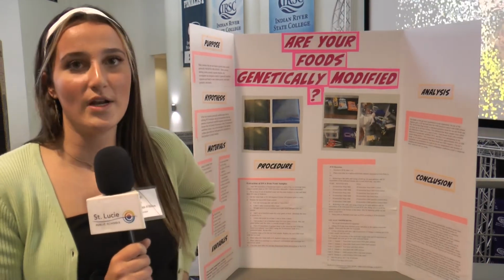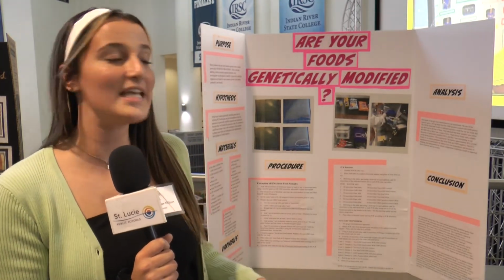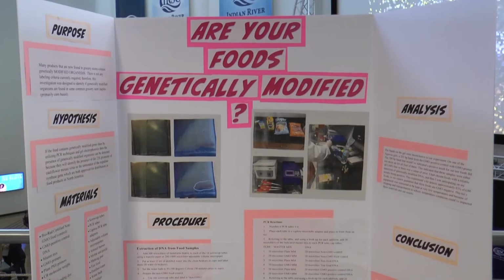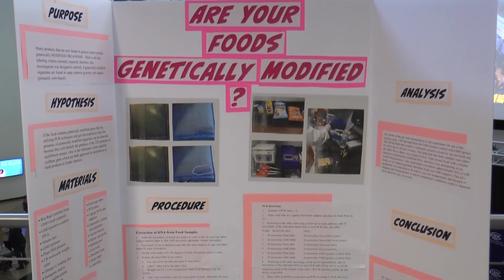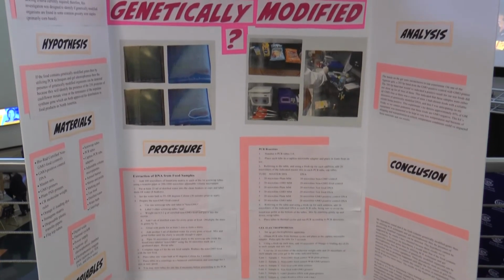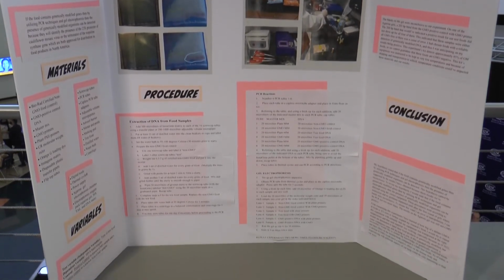And as of 2022, there's a new law that companies have to label their foods as bioengineered or not. So my hypothesis was that if I use these PCR techniques and gel electrophoresis, I would find that there were some genetically modified genes in the foods.